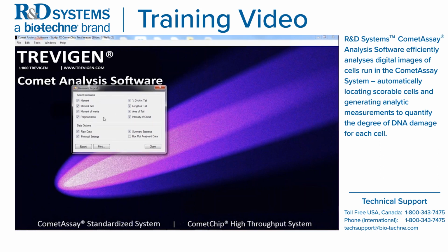In this window, it really depends. The software takes certain measurements: moment arm, moment of inertia, fragmentation, percent DNA in the tail, length, area, and intensity of comet. You also have a series of options for how you'd like to export. Let's say first of all, I only want to export the measurement percent DNA in the tail. For my data options, I want all the raw data. I want to know what the protocol setting was that allowed me to draw the boxes around my image. And I also want the summary statistics.